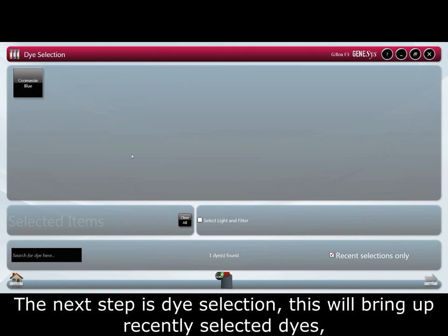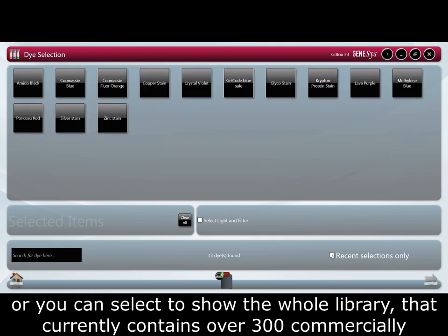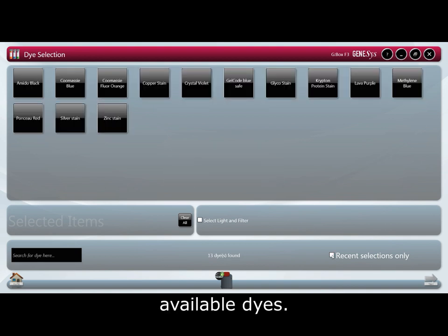The next step is dye selection. This will bring up recently selected dyes, or you can select to show the whole library, which currently contains over 300 commercially available dyes.